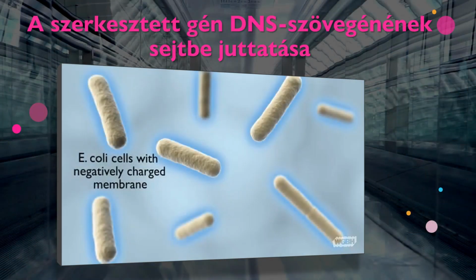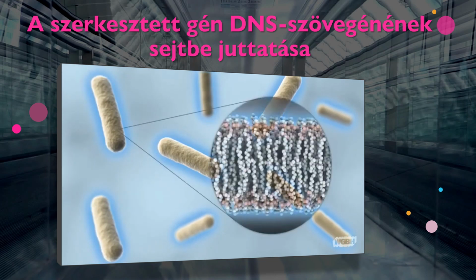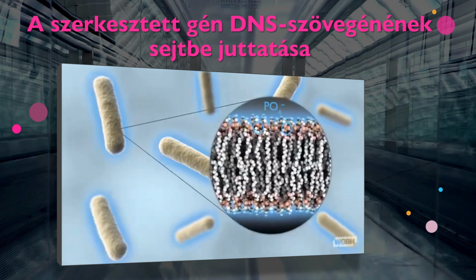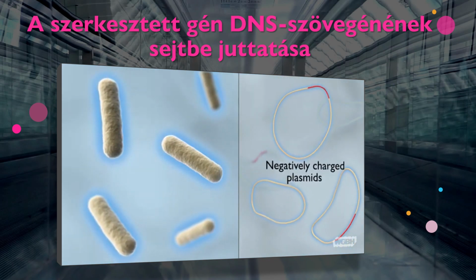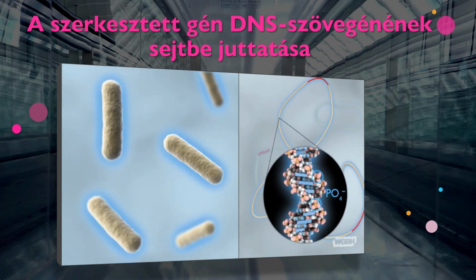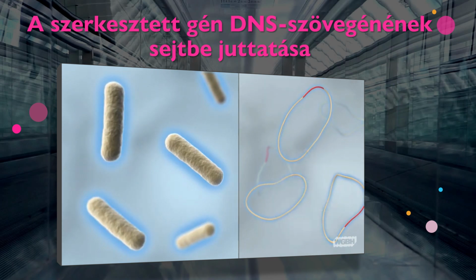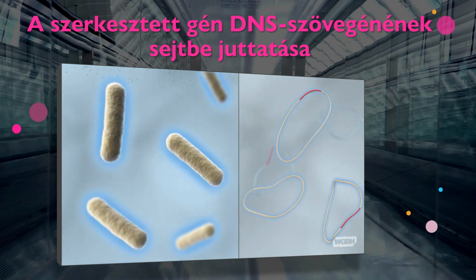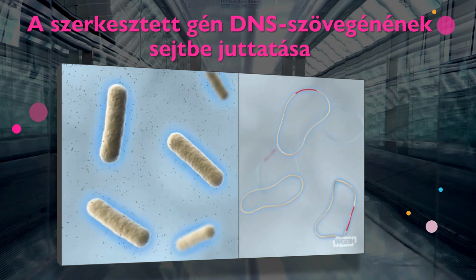The goal of transformation is to cause bacteria, in this case E. coli, to pick up DNA plasmids from their environment. The bacteria are negatively charged because of the structure of their lipid bilayer cell membrane. And the plasmids are negatively charged as well because of their DNA's phosphate backbone. Since they are both negatively charged, they tend to repel one another. To facilitate this interaction, calcium chloride is mixed in with the bacterial cells.